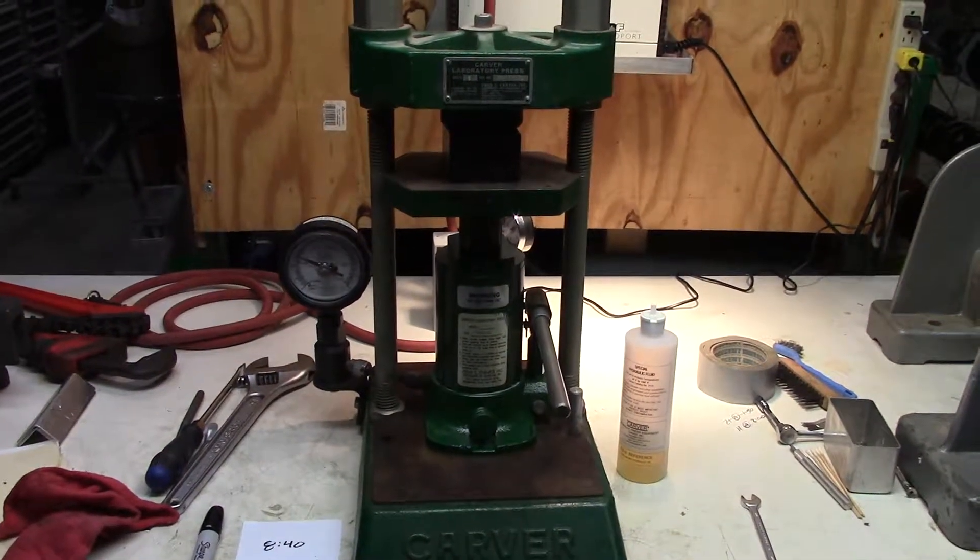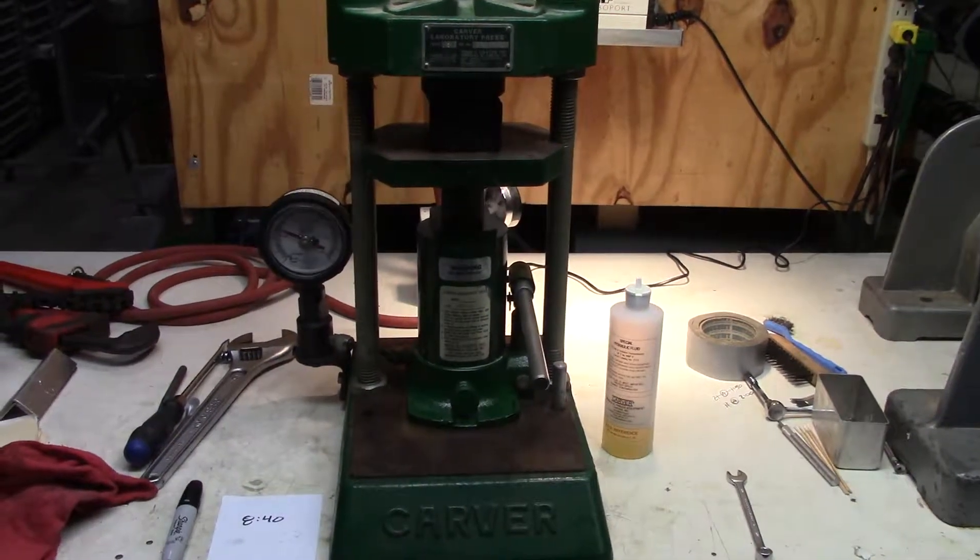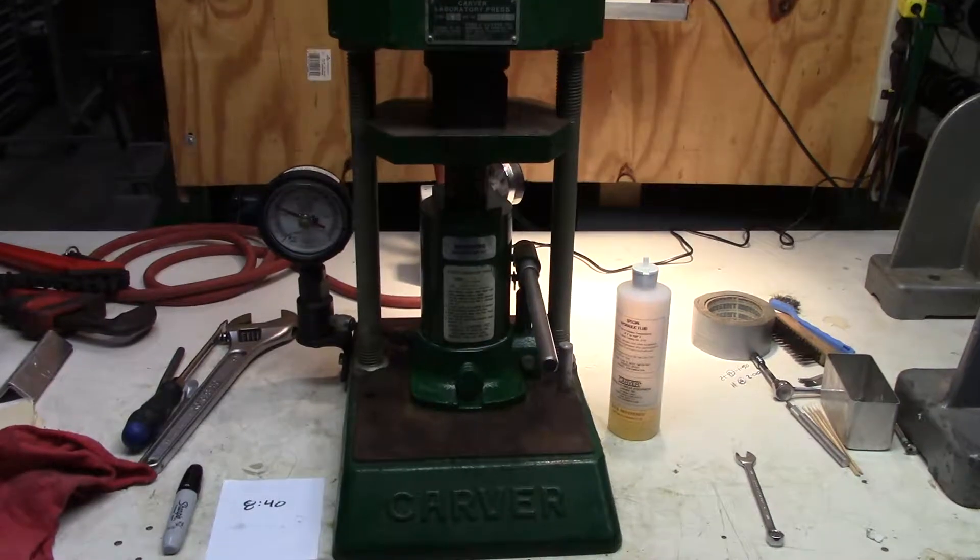Hello, this is Kevin from Hitech Trader. Just finished repairing this Carver Press Model C.